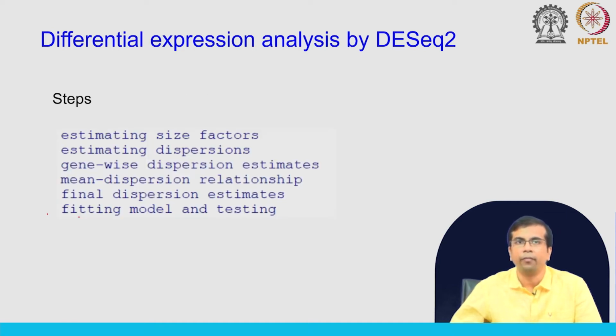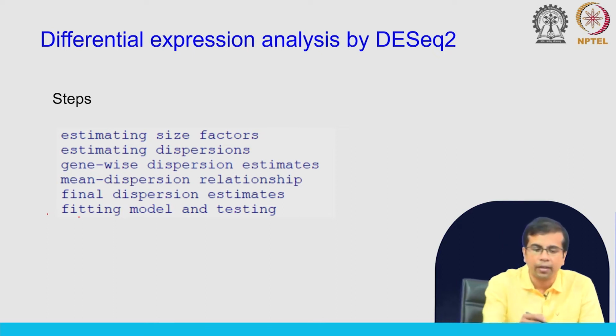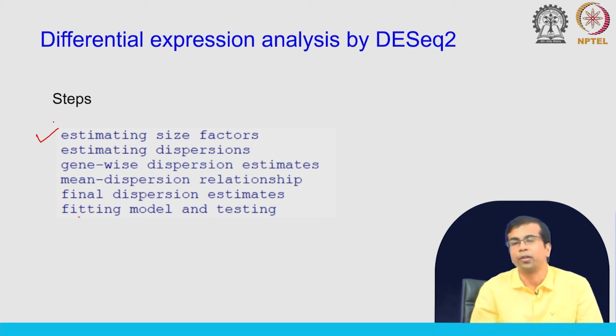Okay. And here are the steps. If you run DESeq2 on this sample, here are the 6 steps, actually. The first step is estimating size factors. You will see when we do the hands on, it will actually give you all these steps one after another.